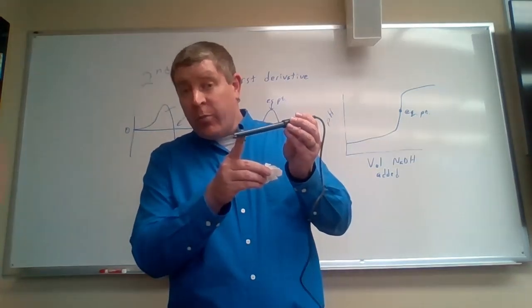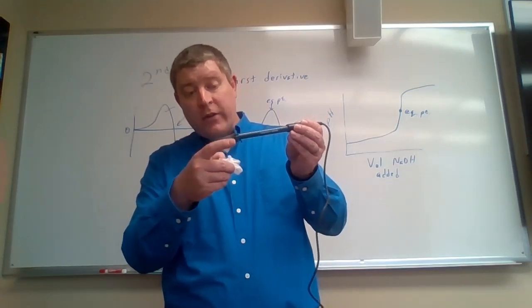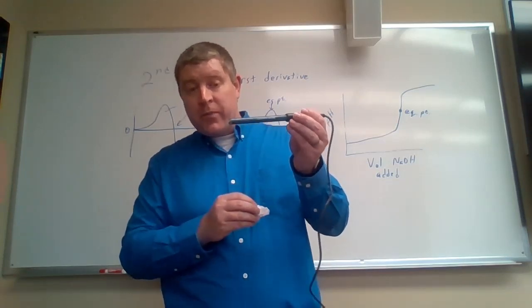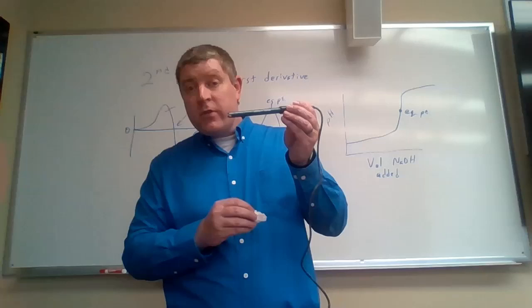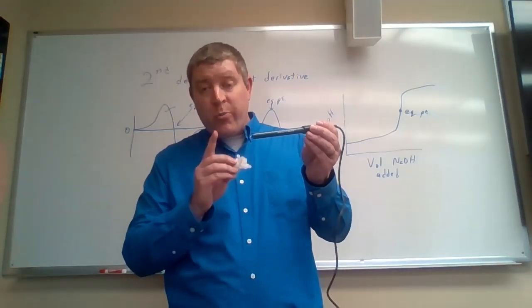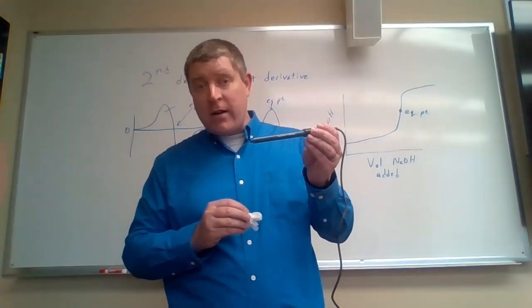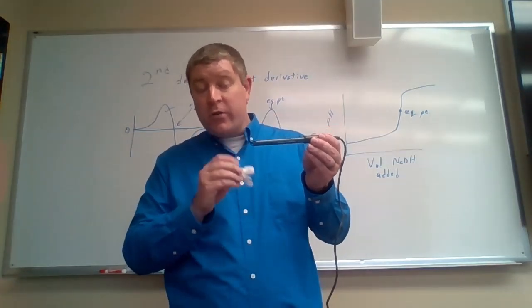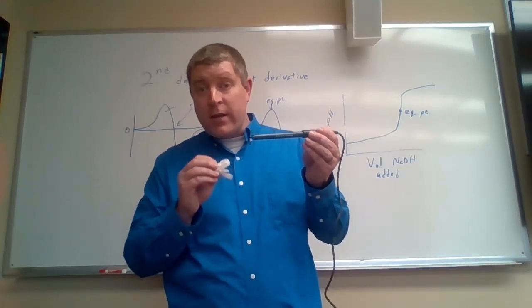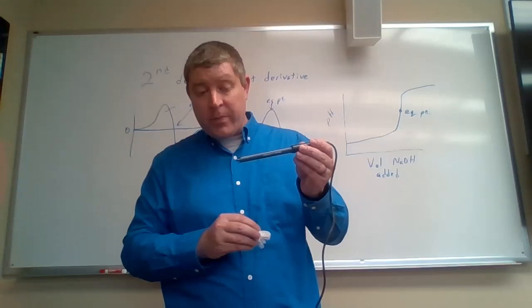Now, that glass bulb has a very thin wall to it, and there are some plastic pieces around the pH probe to try to protect that glass bulb from contacting anything else, but you also need to be super careful not to have anything smash into that glass bulb, because again, it is very thin glass and it fairly easily will break, and that ruins the entire pH probe.